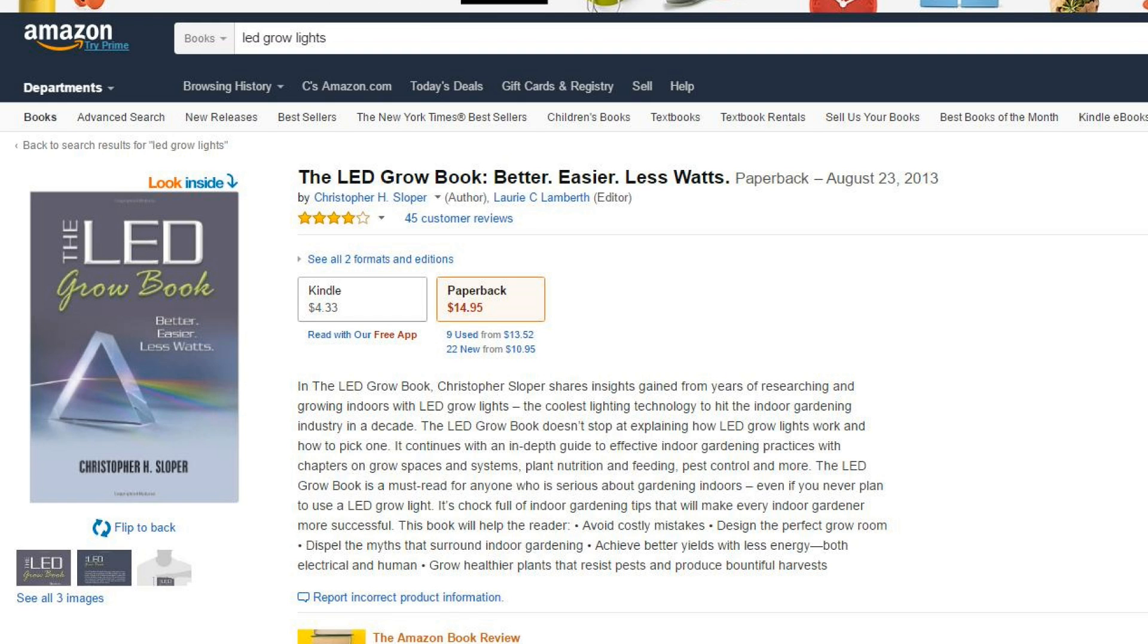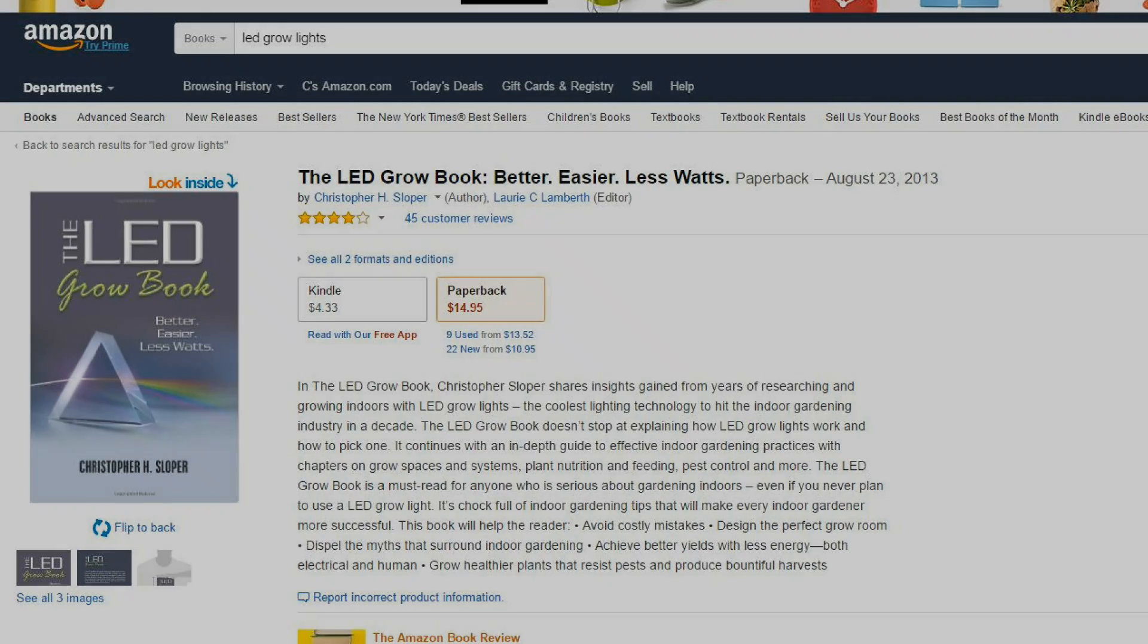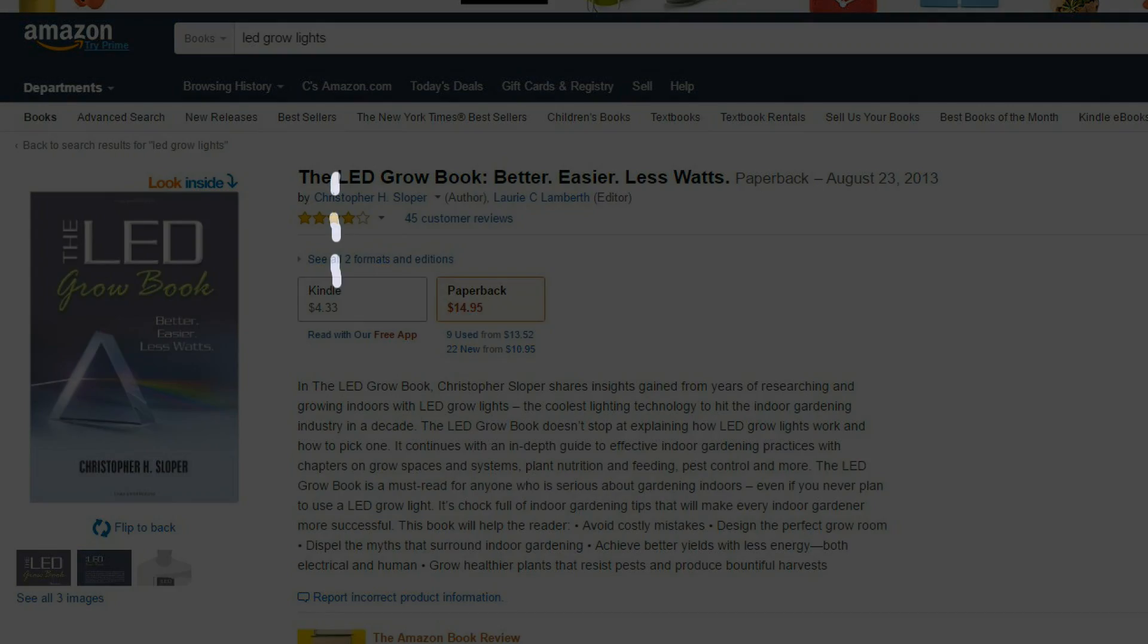Having recently got myself one of these diffraction gratings, I got to thinking that you could actually make your own spectrometer by using a webcam to look at the spectrum split out by a diffraction grating. If you could calibrate the picture from the webcam, then you'd have a high quality or an accurate spectrometer.